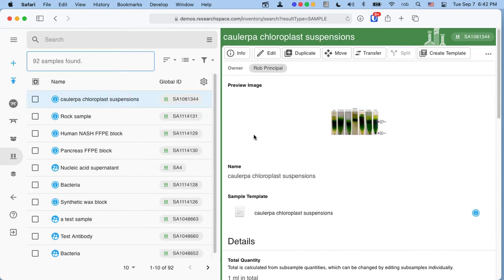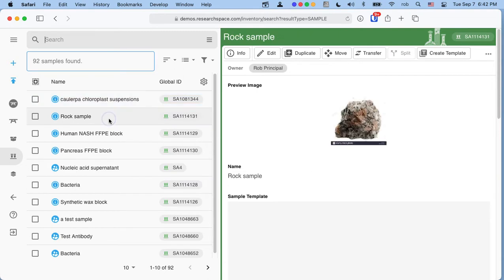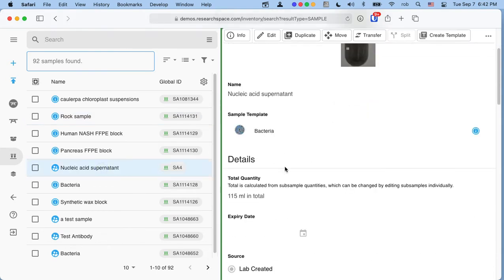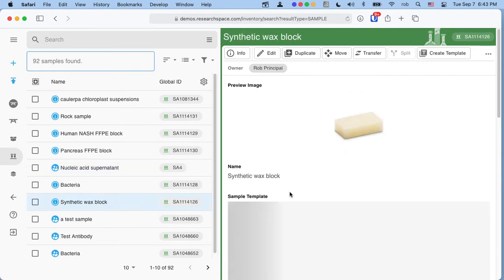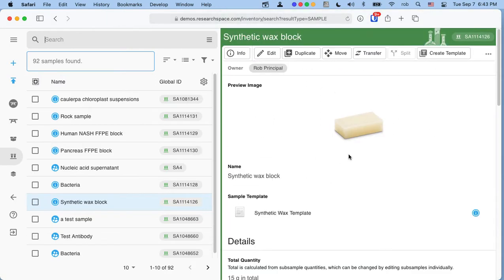On the right, we have what we call the Details panel. And the Details panel allows you to see information about the currently selected item in the navigational tree. So if I click something else here, you'll see that the Details panel will change to show me the details of a different item. Notice that as I select these different items, the details in this panel change because this Details panel is extremely customizable and very smart, and it's designed to show you just information about the particular thing that you've selected in the tree on the left. Both of these panels are highly customizable to let you set up the system in your preferred way so that you can navigate in a way that works for you.